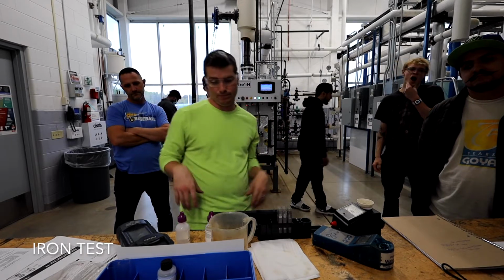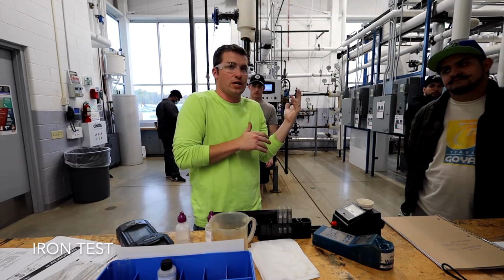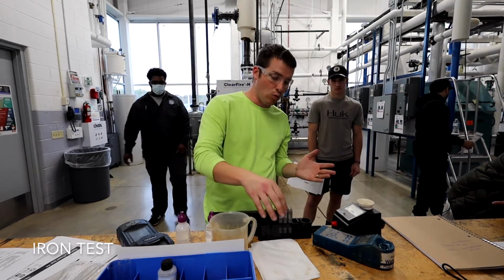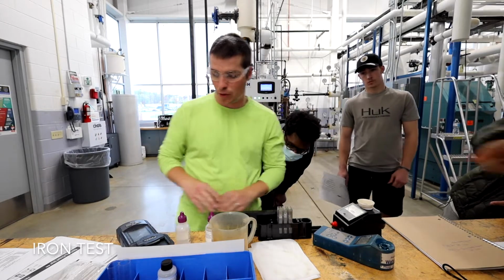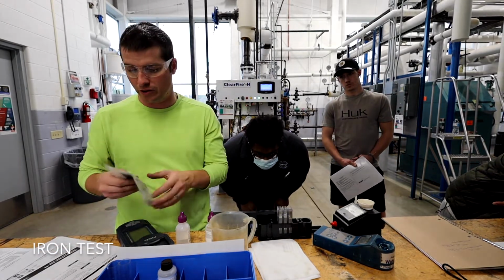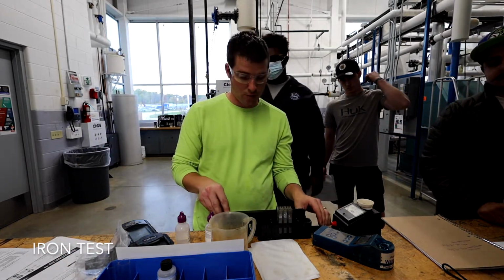So that's pretty good. I would be happy with that. Typically I want to be 0.5 or less in a feed water tank and a boiler, right? So that would turn purple? If there's going to be iron, right? It's going to turn... would it be orange or purple? This one's going to be orange. Yours should turn purple. Mine's orange just because of the type of packet. You can get packets that do different colors. Mine just happens to be orange.